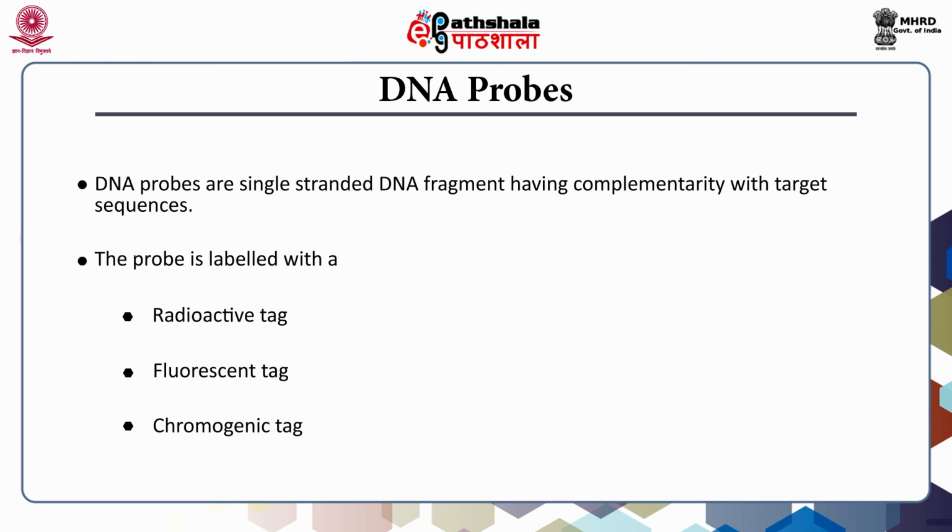Whenever we are using the DNA probe, one has to use very stringent conditions to avoid any false recognition of the signal. If it is not done, then there will be a wrong interpretation of the results. That is, one will wrongly identify a gene of interest from the sample. So it is very essential that the gene probe is repeatedly checked whether the reaction is specific or not under the experimental conditions.